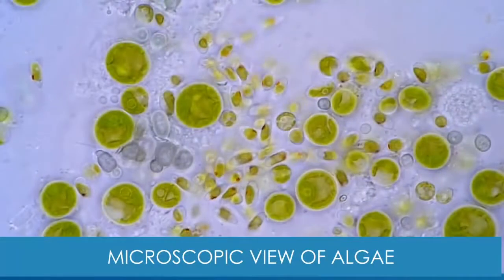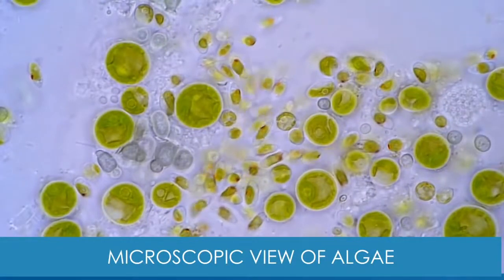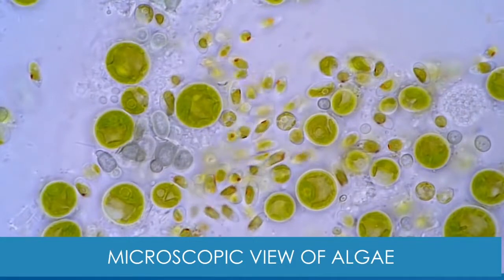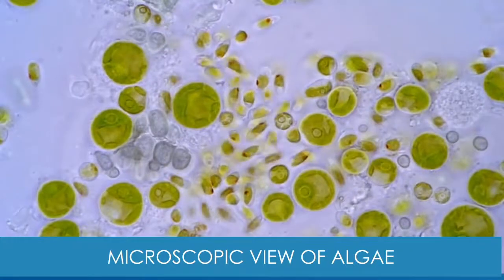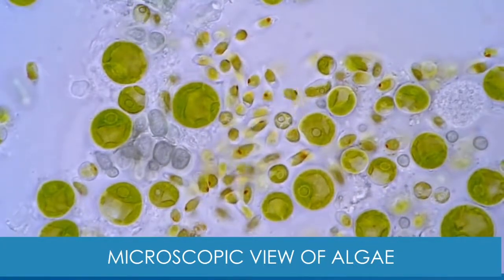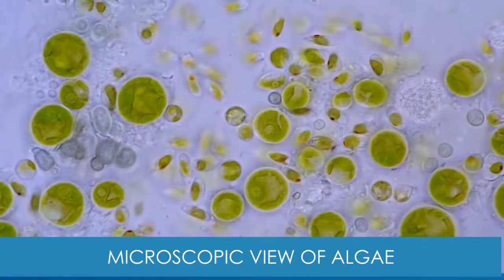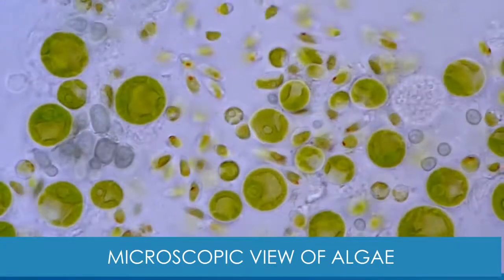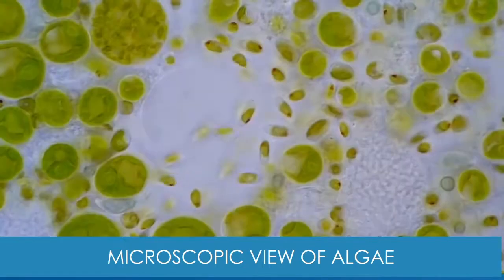When we put a drop of water or unpurified water on a glass slide and observe it under a microscope, we can see millions of algae floating over it. They are mostly colored and possess light-trapping devices in them. These free-floating particles are called phytoplanktons. The vegetative part of algae is called thallus. In this class, we are learning about the thallus structure.